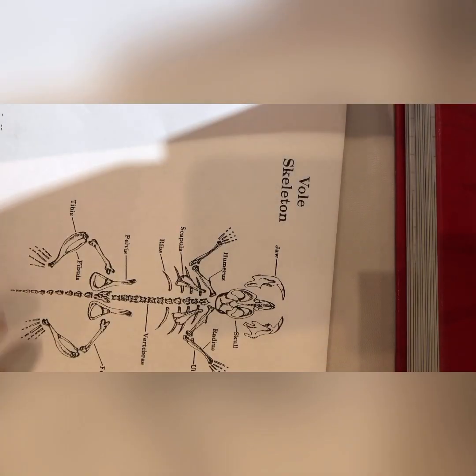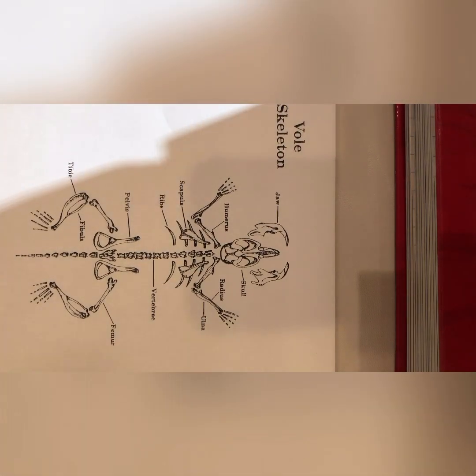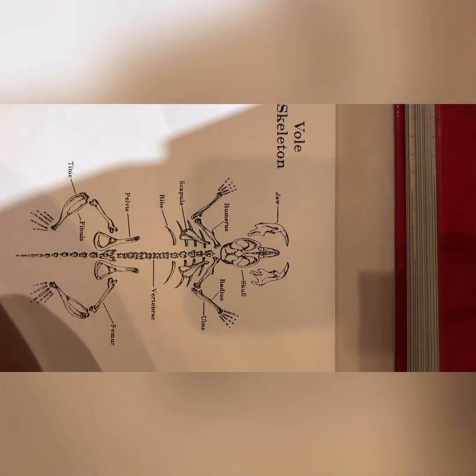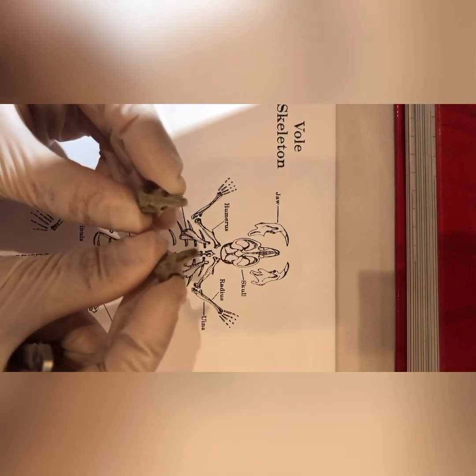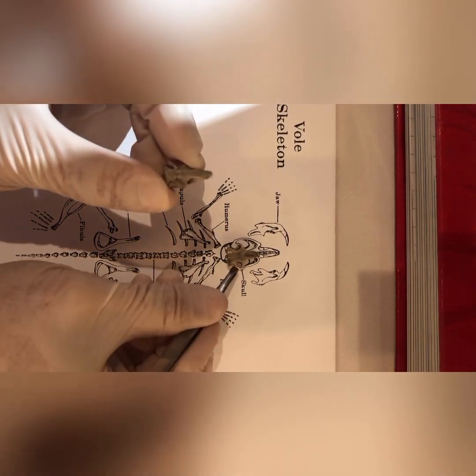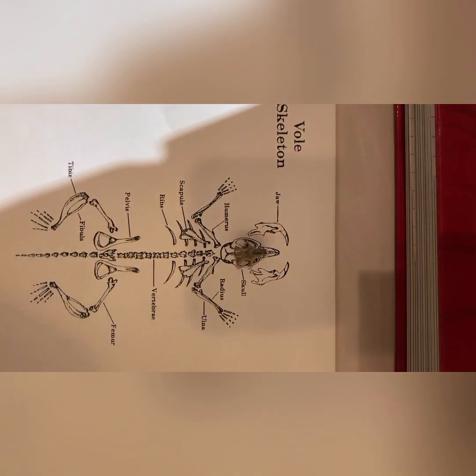So we're gonna go back. Most probably I have a vole here, and let's see if I can reconstruct it using my bones and my skull. How many skulls did I find? I found 2 skulls, and my 2 skulls are pretty similar, both the same size. They look like they would both be a vole. I'm gonna find the one that looks prettiest. I'm gonna place it right over where it should go. And I also found multiple jaws.